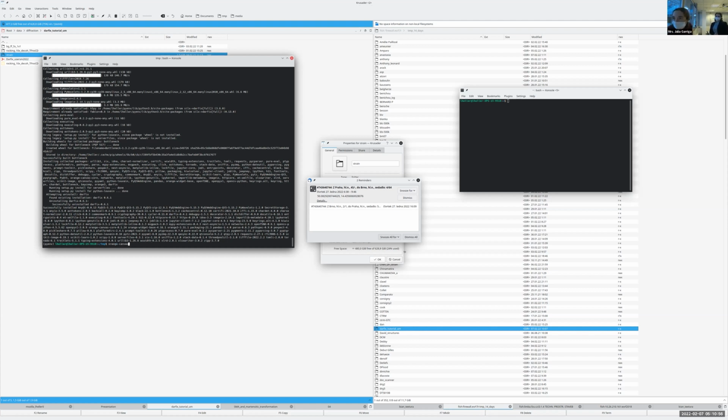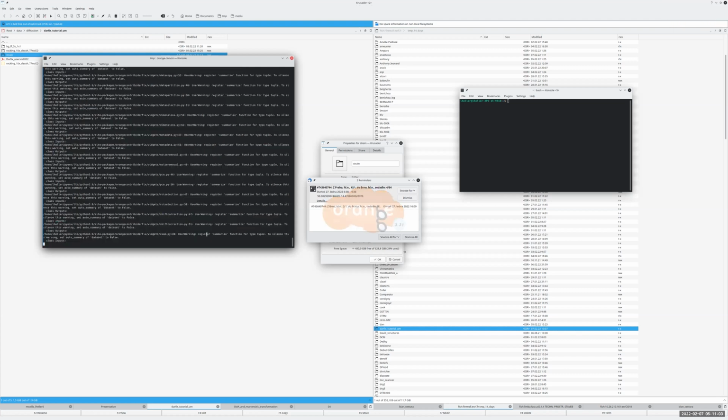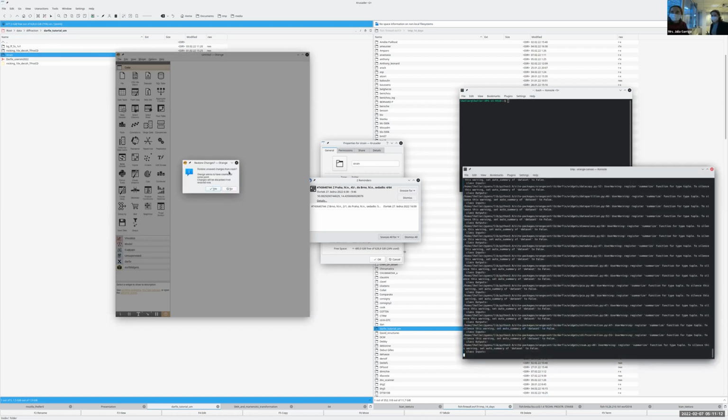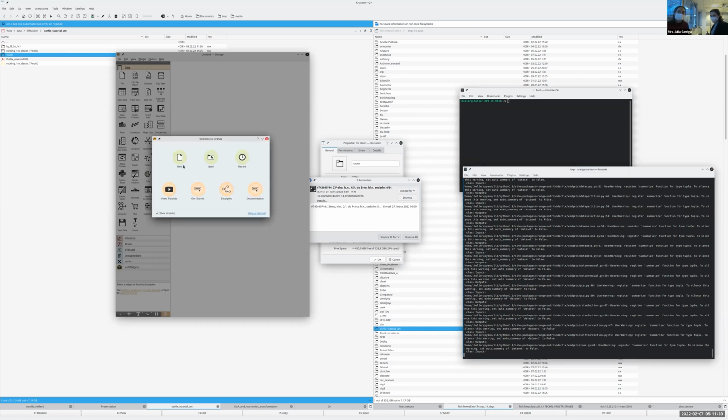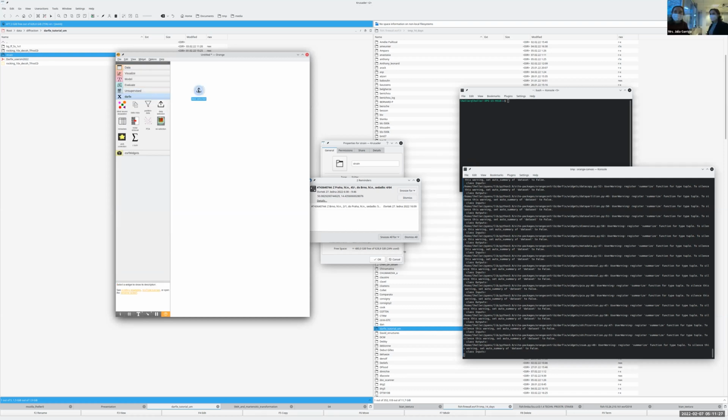Okay, let's see if it completes everything. 3.31. Well, that was Orange. Okay, that sounds good. Now there's the Darfix and the ESRF packages. Orange still has the old version of Darfix. You still have an old version of Darfix.